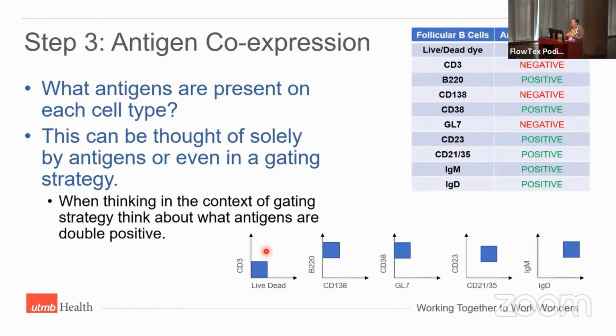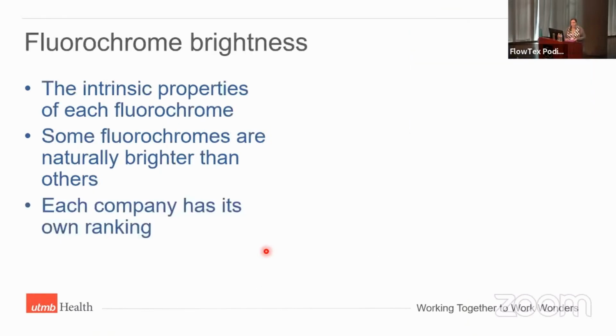And I will help them, just like Anna mentioned, that she will go over the gating strategy with them. I will also help them come up with the gating strategy that they need. But basically, what cells are you expecting, positive and negative? Do you expect co-expression or not co-expression? So we go over that.